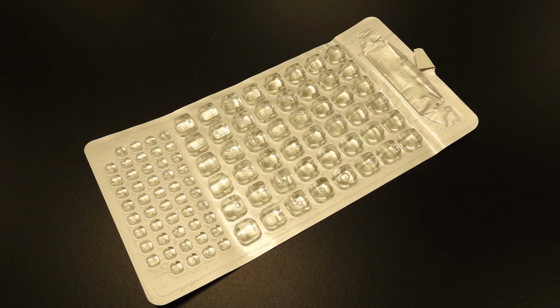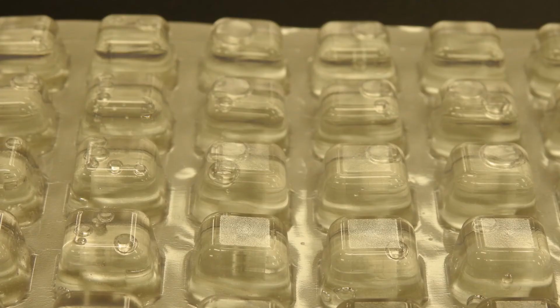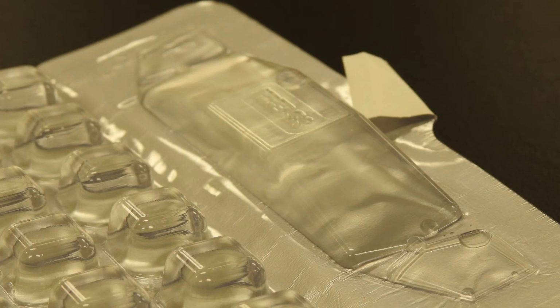Here I've included some shots of what you would expect those trays to look like, some zoomed in shots too. You can see that some of them have bubbles. Ideally you want to prevent any air pockets, but it's okay to have those in there. You don't need to worry about meticulously shaking them out. And then at the end there you can see that there is that final tray, the largest cell at the end, is actually simply an overflow tray, so you don't need to worry about filling that tray up.